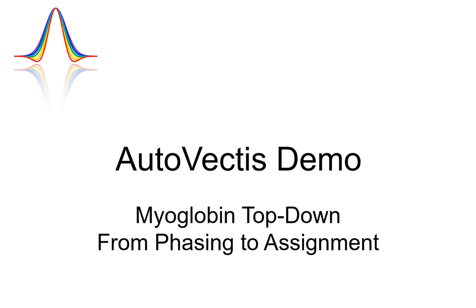In this video, I'll provide a quick demo of the top-down assignment workflow in AutoVectis. We'll be starting with an ICR transient stored in the Bruker .d file and process it all the way through the workflow to a top-down sequence map, including the internal fragments.